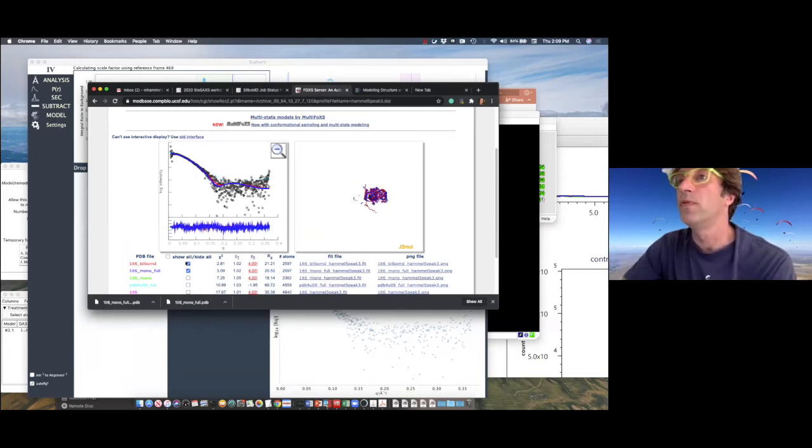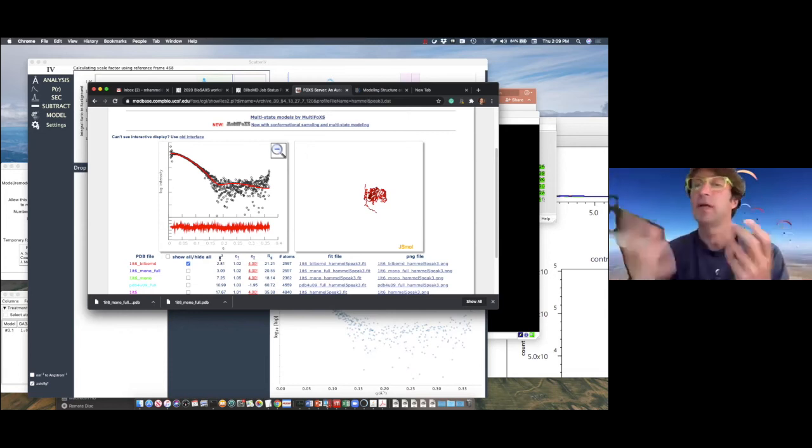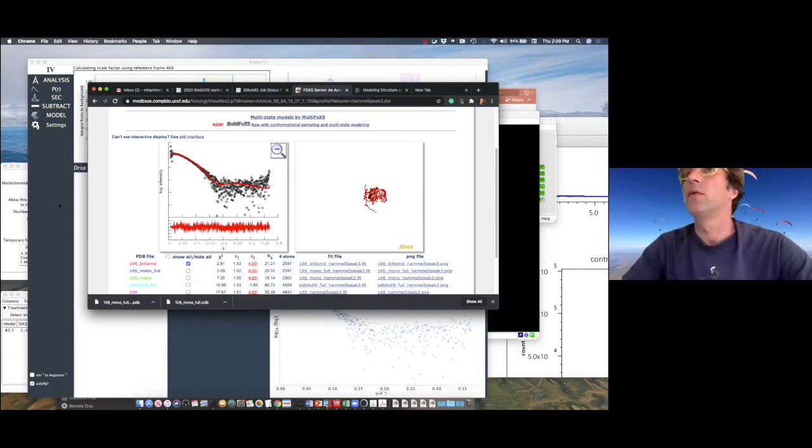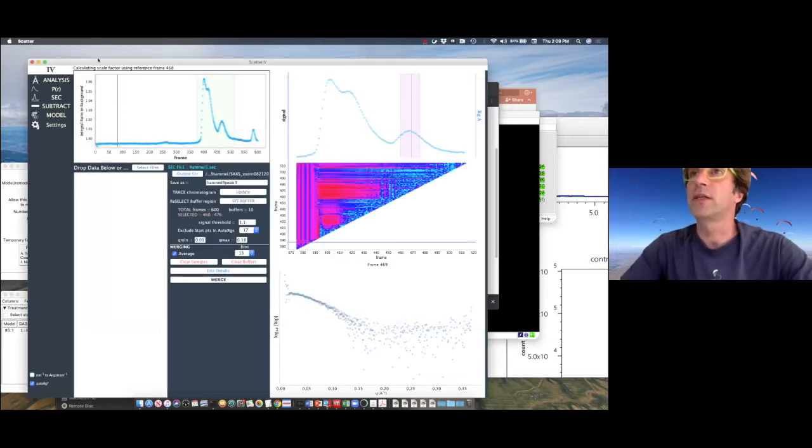We improve the fit a little bit with Bilbo MD. The improvement from 3 to 2.8 is not very significant, but it's good enough to tell you in this case there is not so much to improve with the movement of the linker. But when you move into regions and domains, you can improve the fit dramatically with the flexibility of the domains. Okay, so let's see if the sketcher can do that.